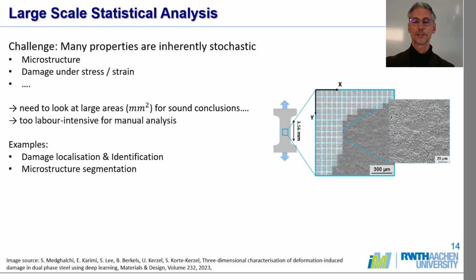Of course we could do this manually in principle, but it's very, very labor intensive, and in practice that becomes a prohibiting factor. So let's look at two examples: damage localization identification and microstructure segmentation.